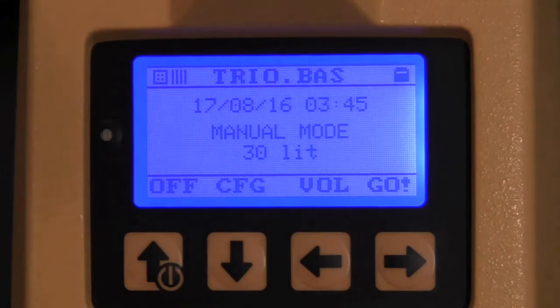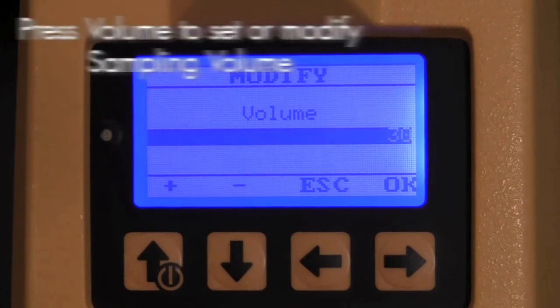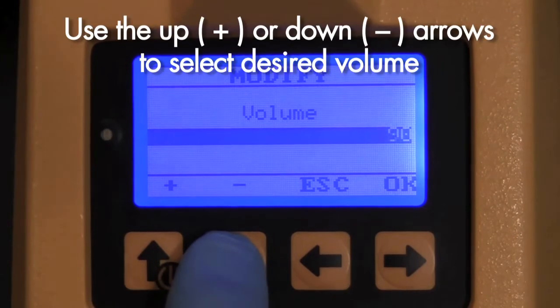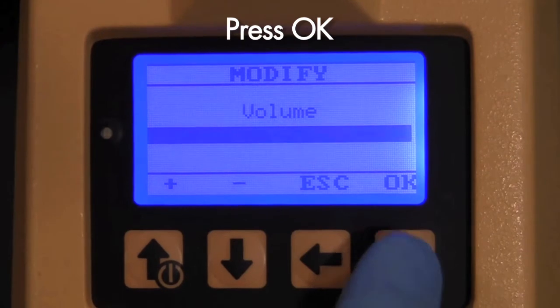While in manual mode, you may set your sampling parameters. Press volume to set or modify your sampling volume. Sampling volumes range from 30 to 1000 liters. Use the up or down arrows to select your desired volume, then press OK.